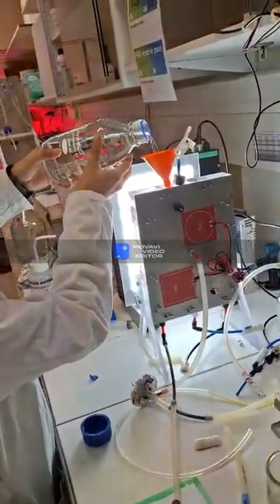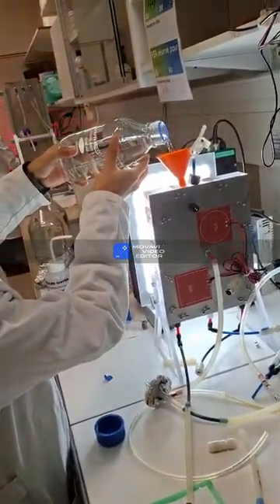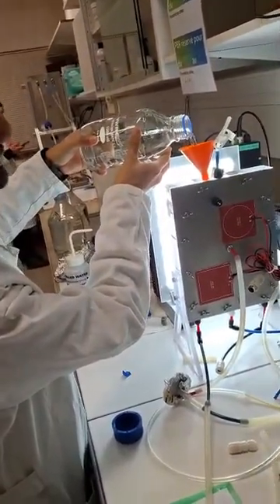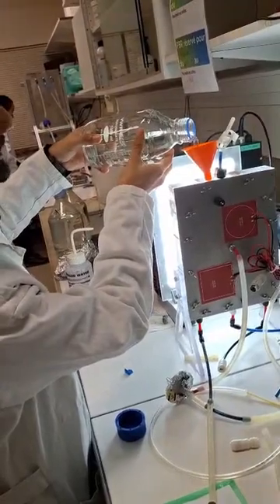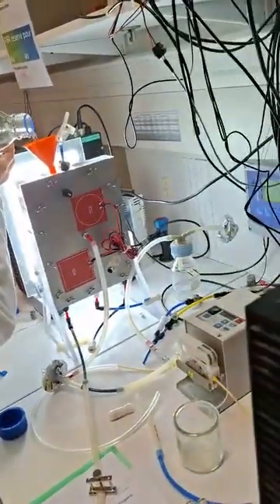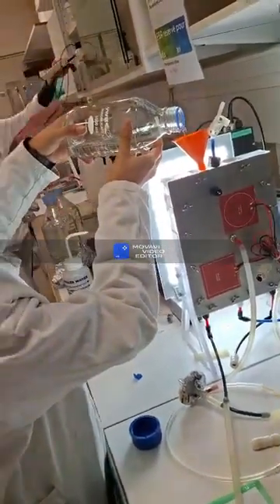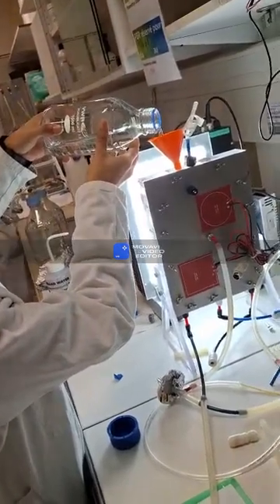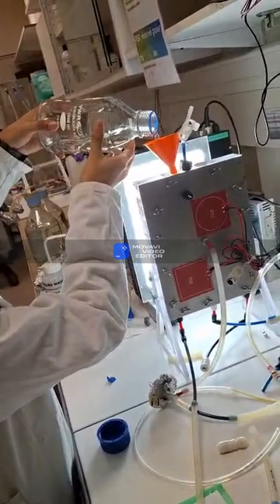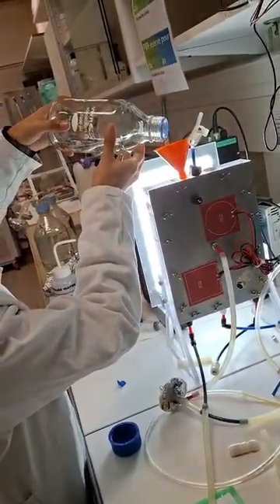Don't we have to pour it a bit slower, or is it okay? Perfect. This is just water. We want to check if they are leaking, so just check during the refilling. But the amount of nutrient, we have to calculate, or we can supply directly to the ammonia.